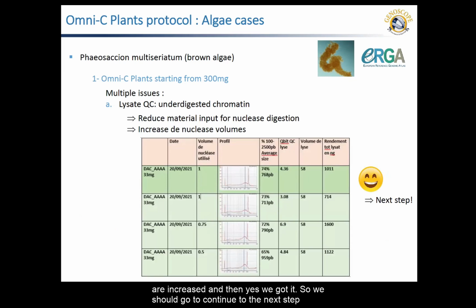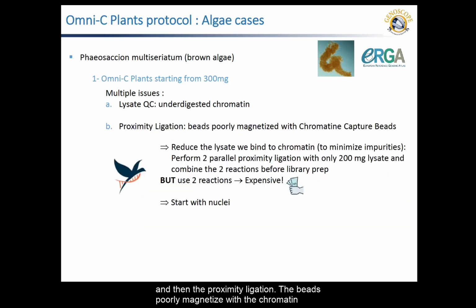So we should continue to the next step, the proximity ligation. But the beads did not fully magnetize with the chromatin capture beads. So we contacted the Dovetail support.